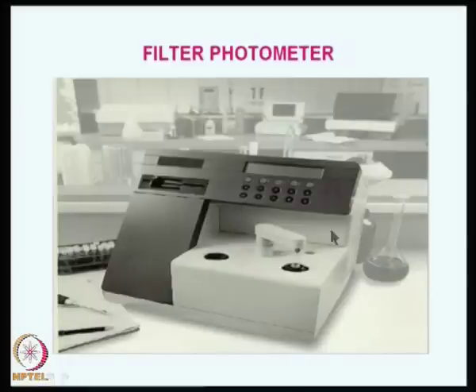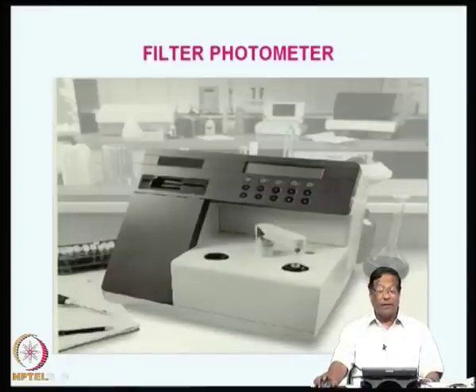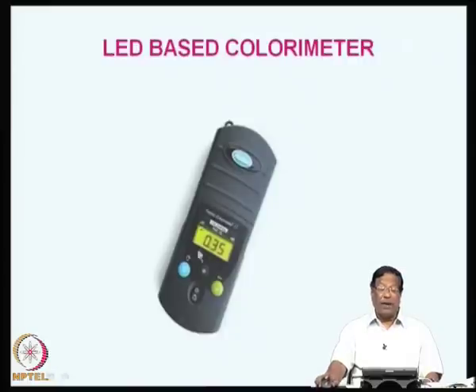Now, these are filter photometers. This is the figure of a modern filter photometer. You can see that here are the sample solutions to be inserted, the body is here, the detector would be somewhere inside, and the optics would be like this. And this is a very low cost LED based colorimeter, which I was telling is something like a filter photometer, but a dedicated instrument, very low cost, and the display here is in terms of concentration. It is reading 0.035, but it can be any value depending upon the concentration.